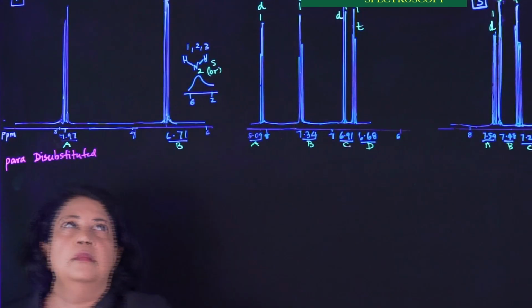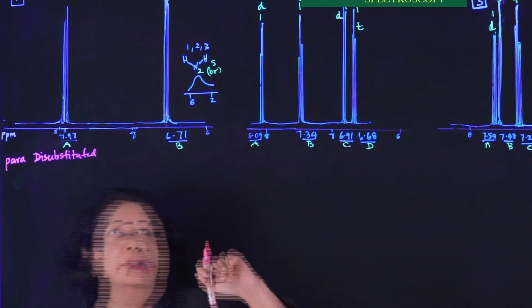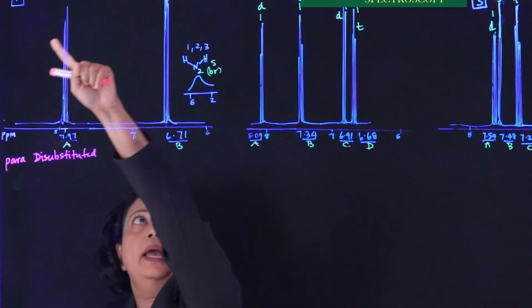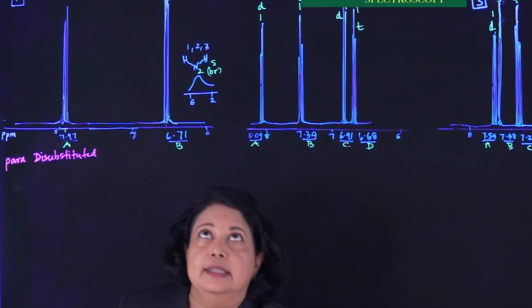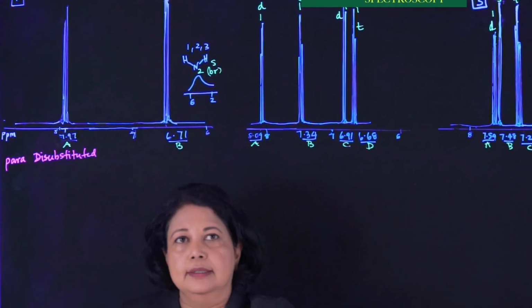This is more kind of explaining this pattern here, and trying to figure it out from all of these values. Now all 3 of them, 1, 2, and 3, would also have NH2 peaks, and typically they'll be somewhere below 6. So it'll be a broad singlet, and there'll be 2 hydrogens underneath it.